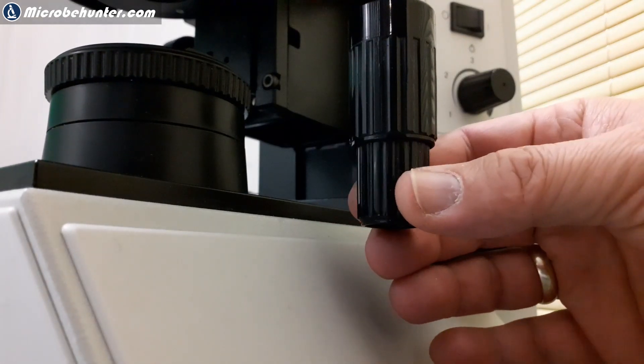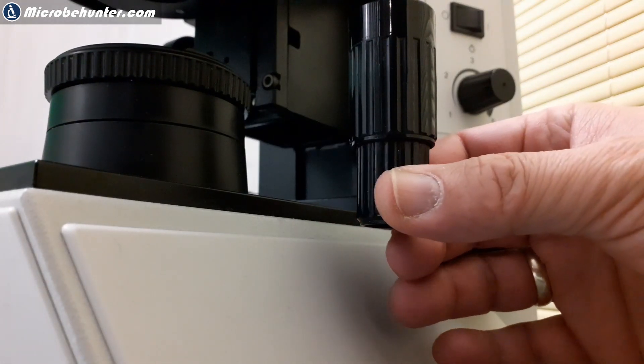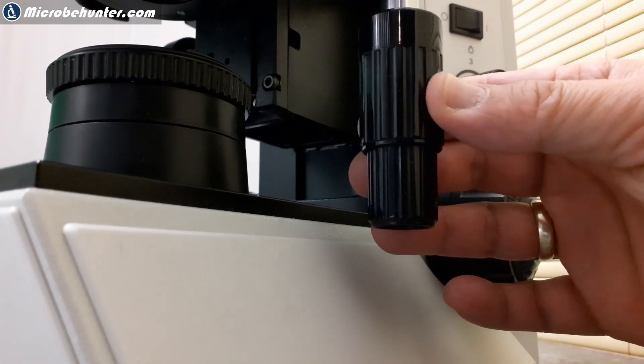I even considered attaching a small stepper motor to my mechanical stage and then having some kind of electronic control so that the motor would turn the mechanical stage knobs for me to give it a really smooth movement. But that was actually way too complicated and it's also not necessary.